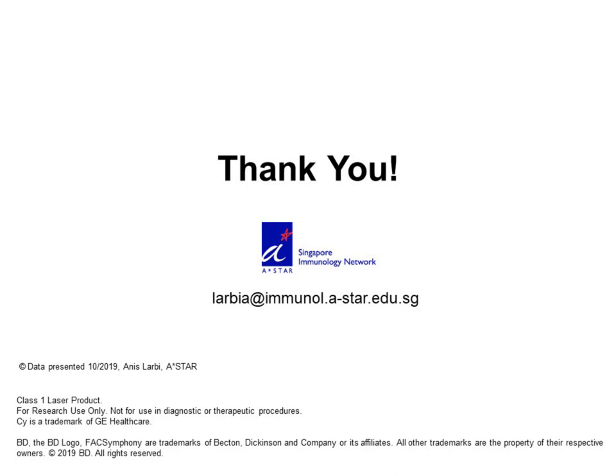It's better to focus not on the absolute value, but on how the different fluorochrome staining indexes are higher or lower. You can find some websites that give you a relative ranking of brightness using standard analysis. I think they are more or less all matching, but it's still important that you do it yourself in your instrument.